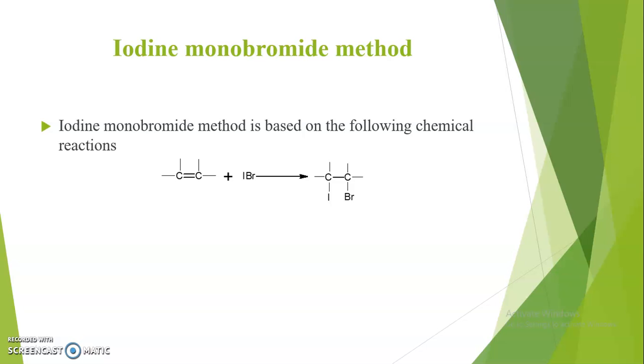Now, how is the oxidation reduction reaction carried out here? As I said, in this reaction we use an iodometry type of titration, where iodine is liberated from the reaction between our sample and potassium iodide. Potassium iodide acts as a reducing agent, while our halogenated sample acts as an oxidizing agent.